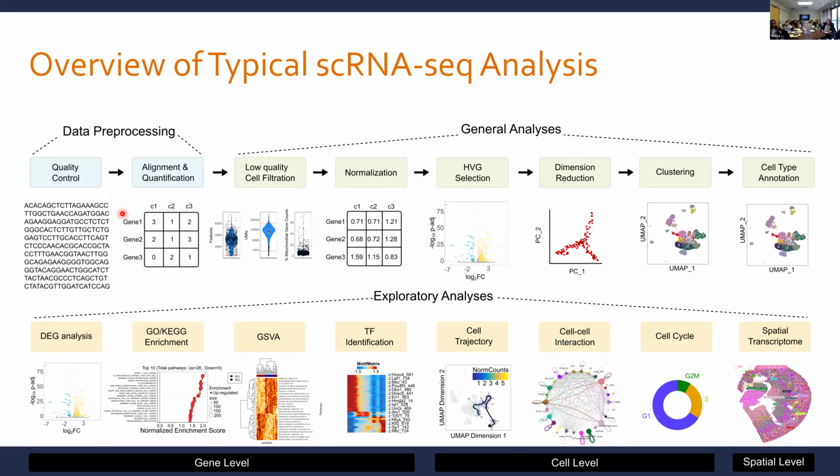In any kind of next-gen sequencing experiment, the first thing you're doing is QC on the actual sequence reads. What's my mapping quality to the genome? Do I have any kind of bias of GCs or ATs in my sequence reads that would suggest something went wrong in sequencing? And then the main thing we're always starting with is, can we generate a count matrix? So we have samples on the X-axis and genes on Y, and then how many times do we see that gene transcript show up in that sample? And that's basically where you're starting from for everything downstream.